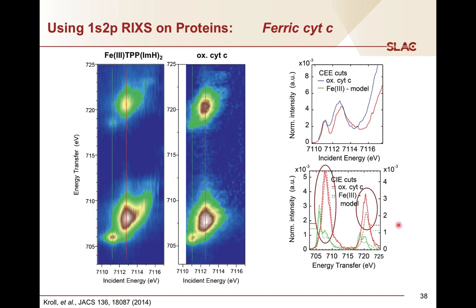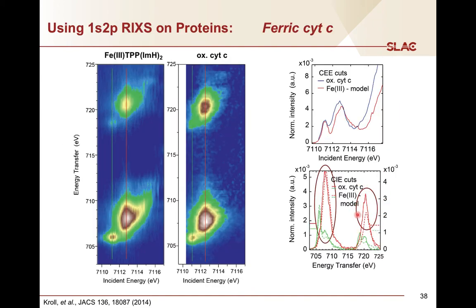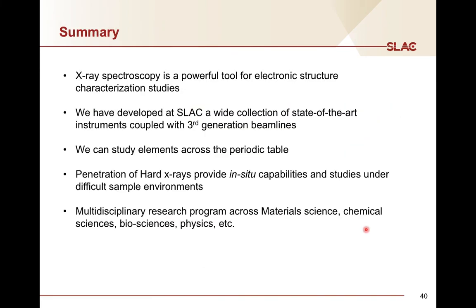And if I go back here, in particular, the change in the L2-like edge, or K-alpha 2, in the resonant K-alpha 2: this increase in intensity when you go from the model complex to the protein, or to the enzyme, reflects an increase in covalency, an increase in covalent mixing, which is actually the characteristic underlying description of this feature here. We have seen that later on also in hemoglobin, actually.